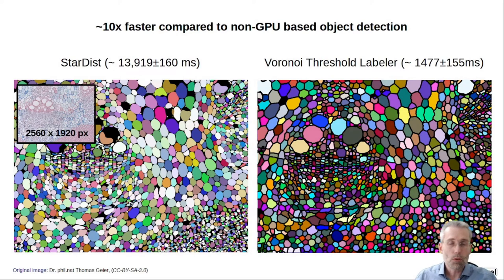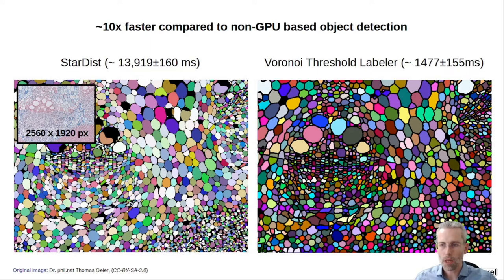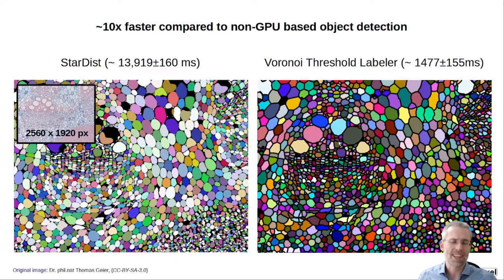Since all the methods are GPU-based, I also made some speed tests to see how fast it performs. Here you see a comparison to StarDist, run non-GPU based. I chose StarDist in this comparison because the image itself has some star-convex shapes, so I thought it would perform quite well — though we actually see that because of the different size range, with very big and very small objects, it may have some trouble detecting them perfectly. This is where the Voronoi Threshold Labeler performed slightly better, and speed-wise it was around 10 times faster in that example. In some 3D examples I had speed improvements up to 15 times versus other standard thresholding-based extraction methods.